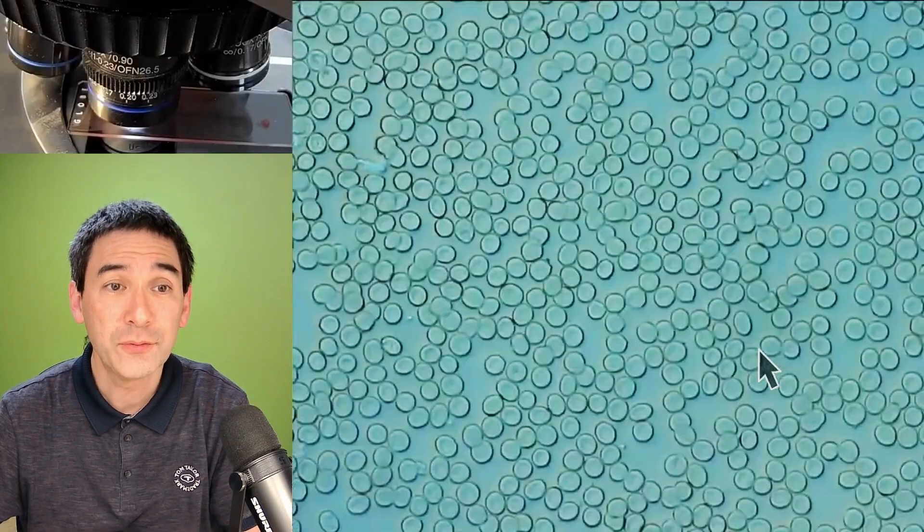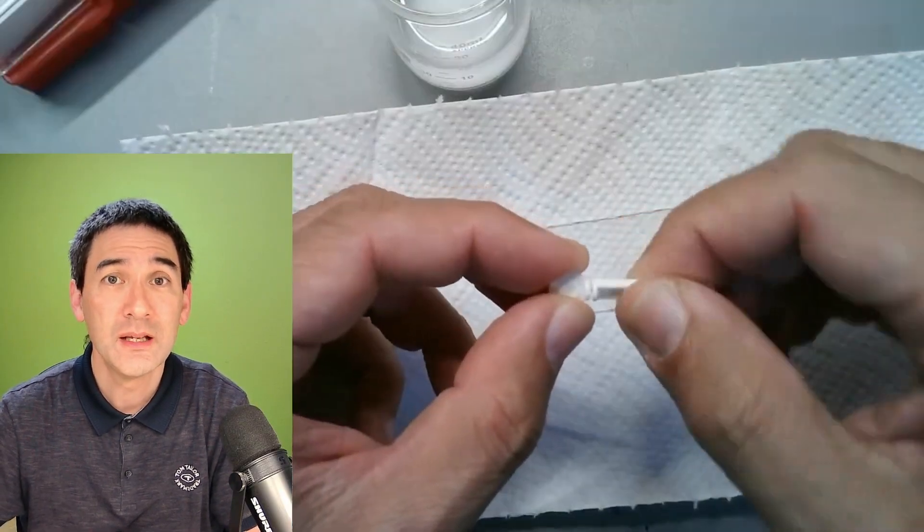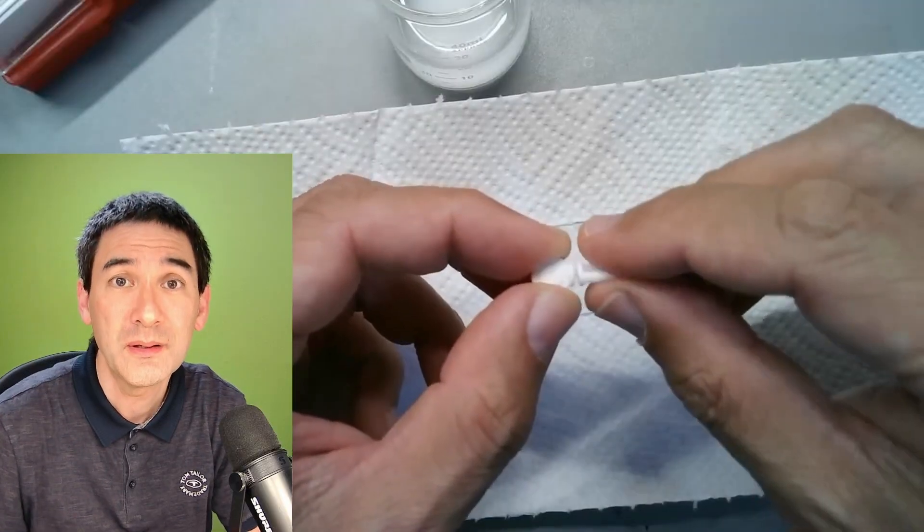And over here again this is a fresh blood sample but here the blood cells essentially started to become stationary.